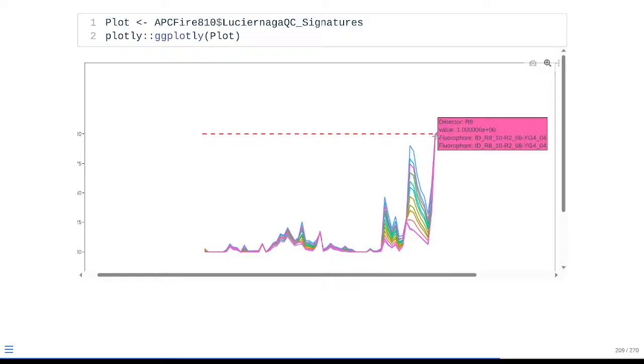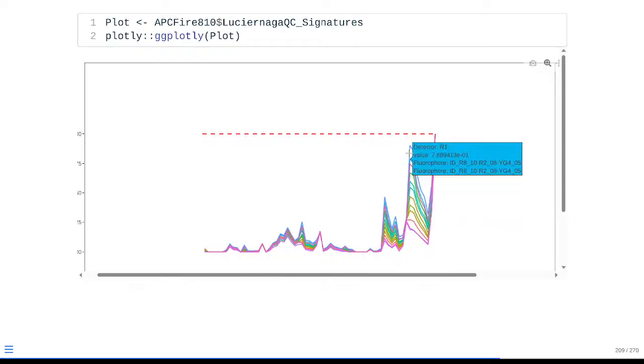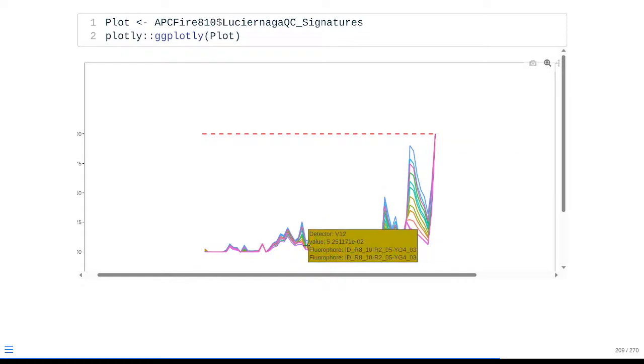So everybody still shares this R8 region, but we can see there's a substantial change for the R1 detector, ranging from maybe 25% of the peak detector, so a 0.25 value, all the way up to nearly being co-equal in emission with the peak itself. And we can also see a bit of stepladder appearance where we expect to see autofluorescence.